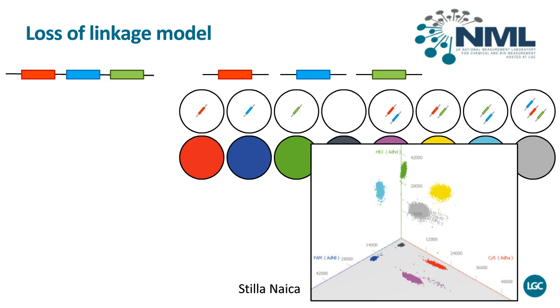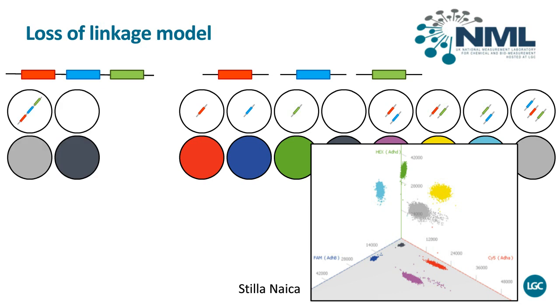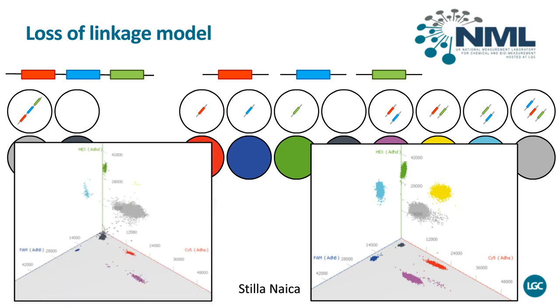And then what we can do is we can compare it to linked molecules. Except we would expect only 2 outcomes. Everything's linked, so they're only going to be that triple positive or they'll be the empties. And this is the kind of output we get. We can apply the numbers to it based on where those molecules are and how they've been pulled out of the correct cluster that they should be in, should they have been independently segregated in the partitions.